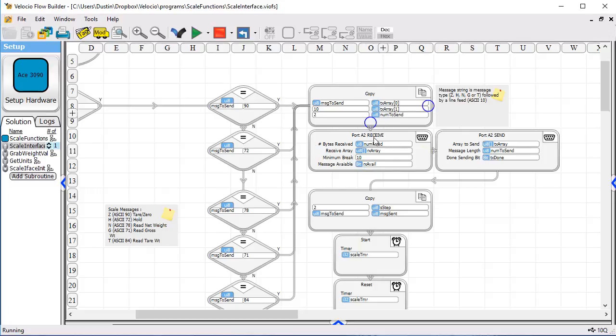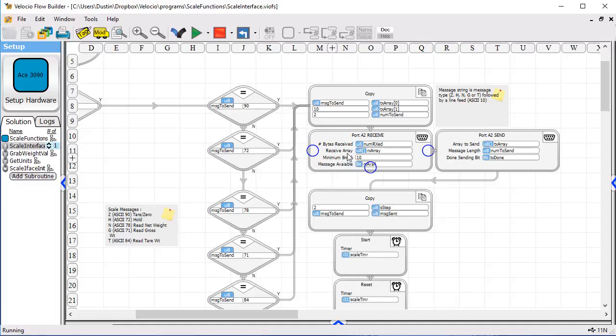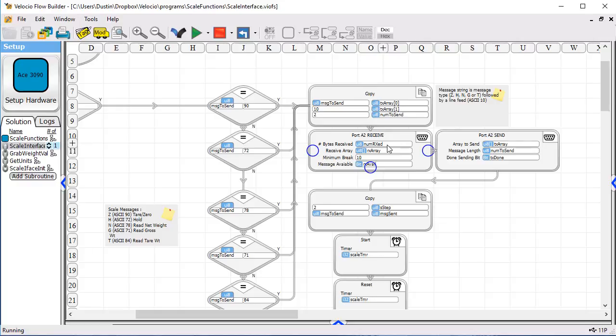After we do that, we set up both our transmit and receive. We set it up to receive, because we know we've got a message coming back, and we set it up so that we put the data into an array called receive array. We select that we want to know how many bytes or characters we've received, so that number will go into a tag called numreceived, and we set it up so that it'll start receiving after a break of 10 milliseconds.